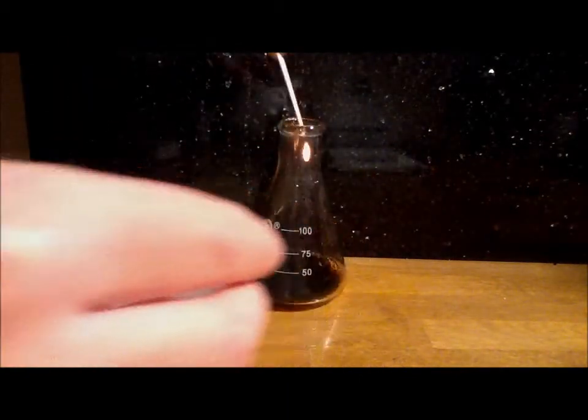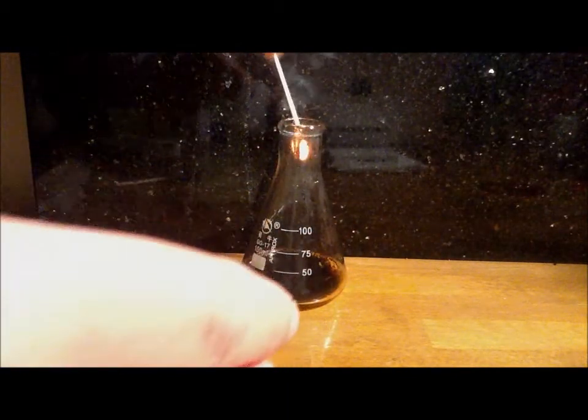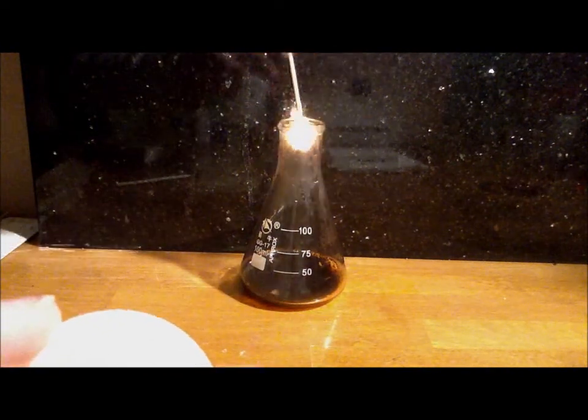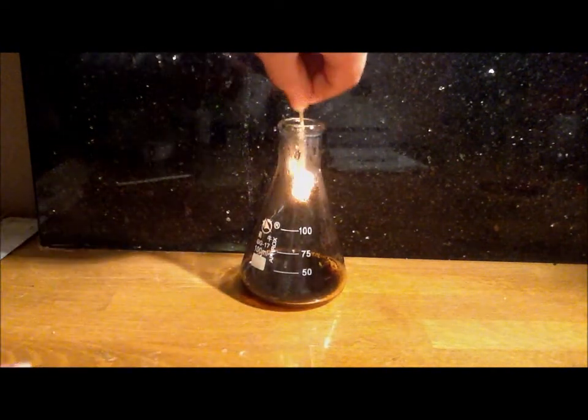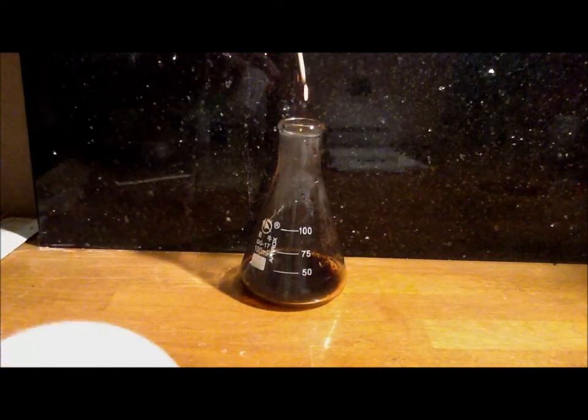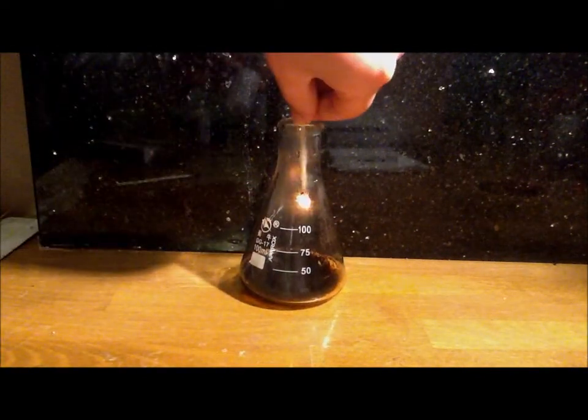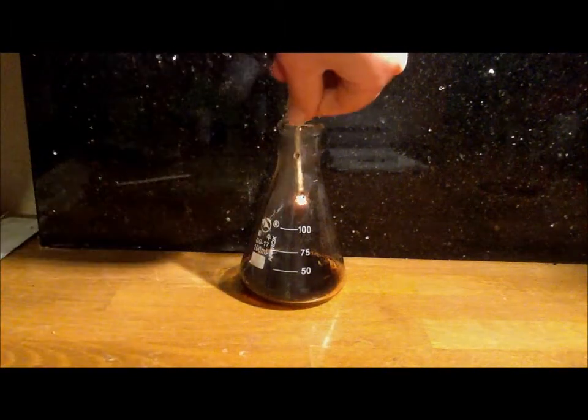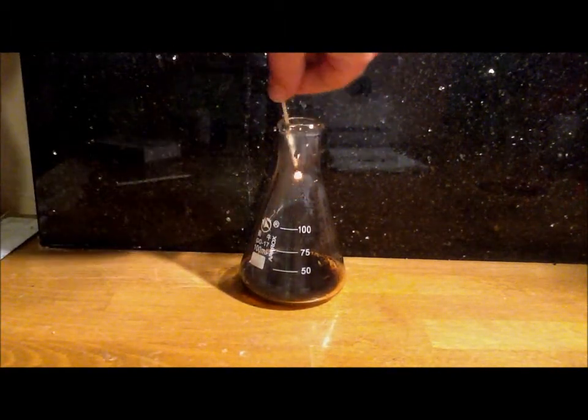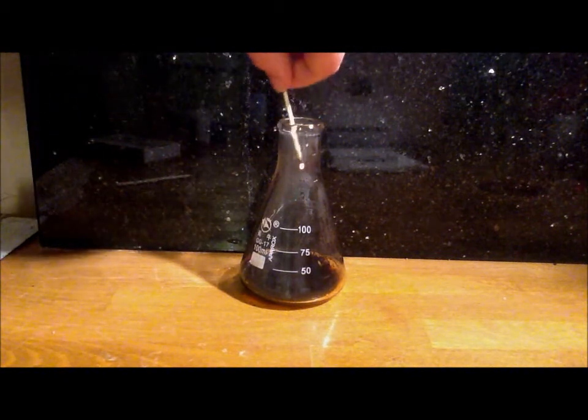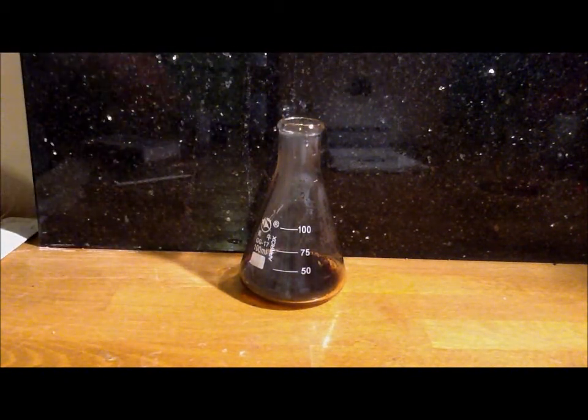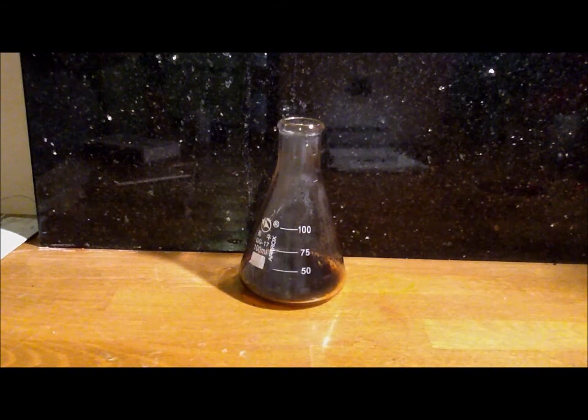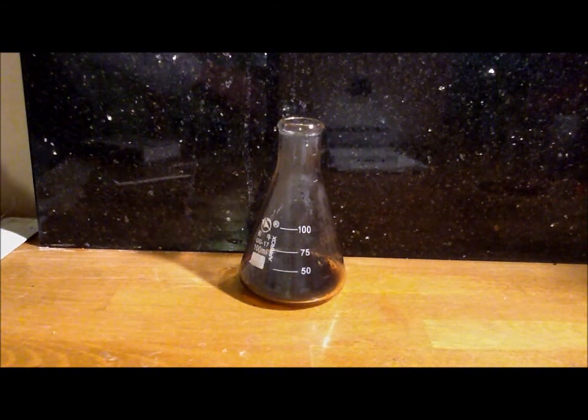Then you see the splint re-light. That's about it. That's about as much as it will get. So I managed to do that six times. So that's how you produce and test for oxygen.